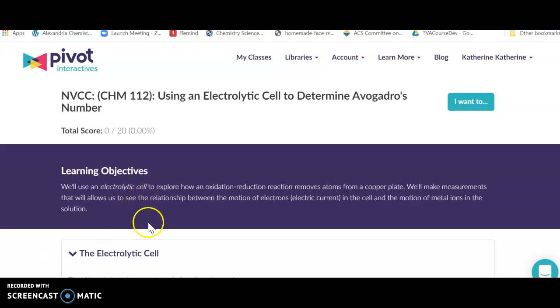We're going to be using an electrolytic cell to determine Avogadro's number. Remember that Avogadro's number is a number of anything per mole, and in this experiment we're going to figure out how many atoms of copper we've used up in this experiment per mole of copper.